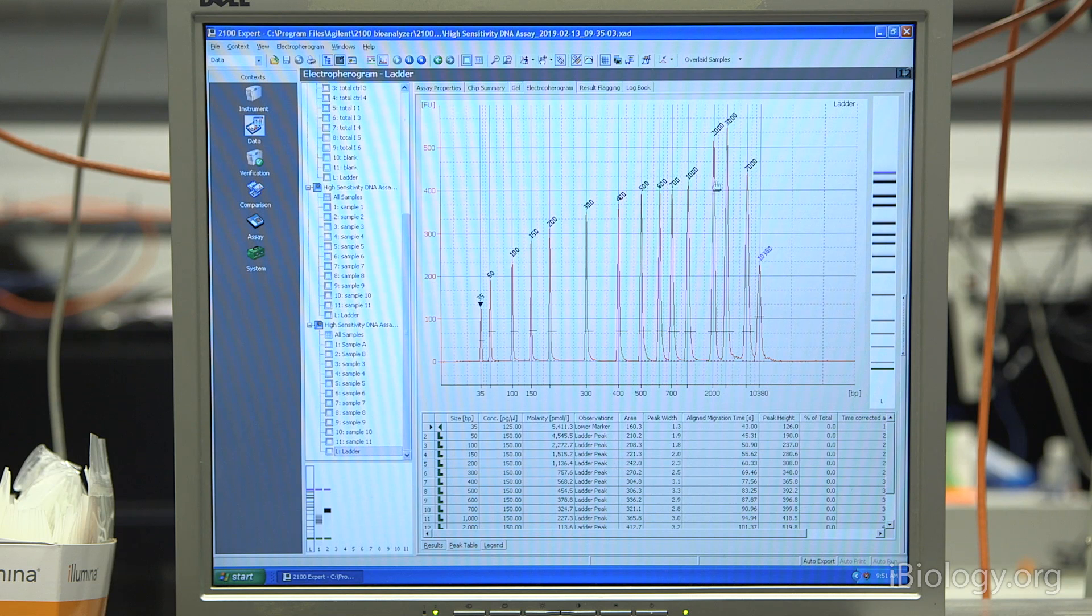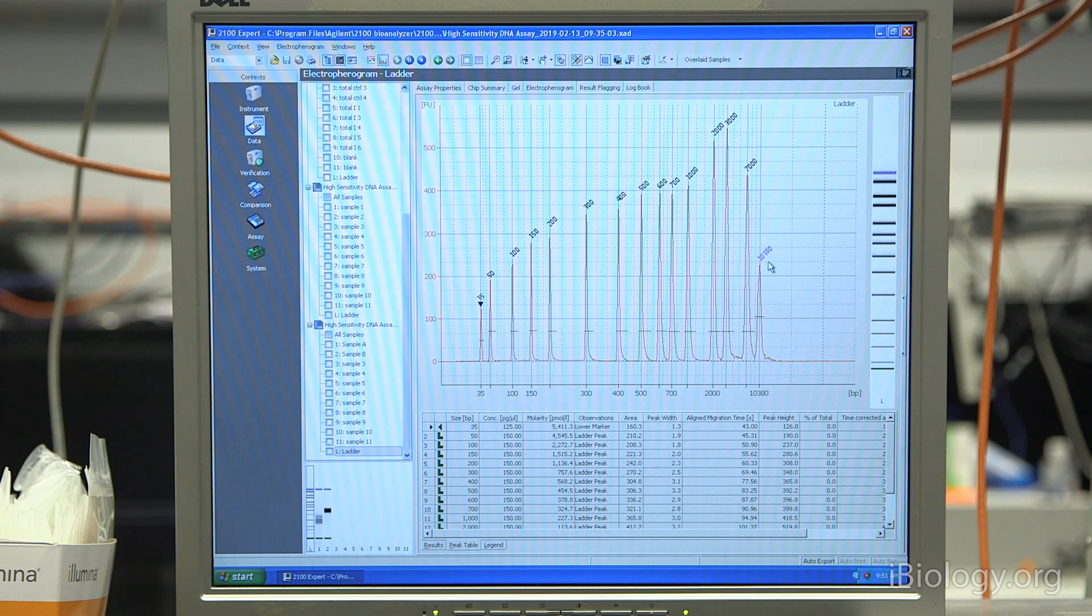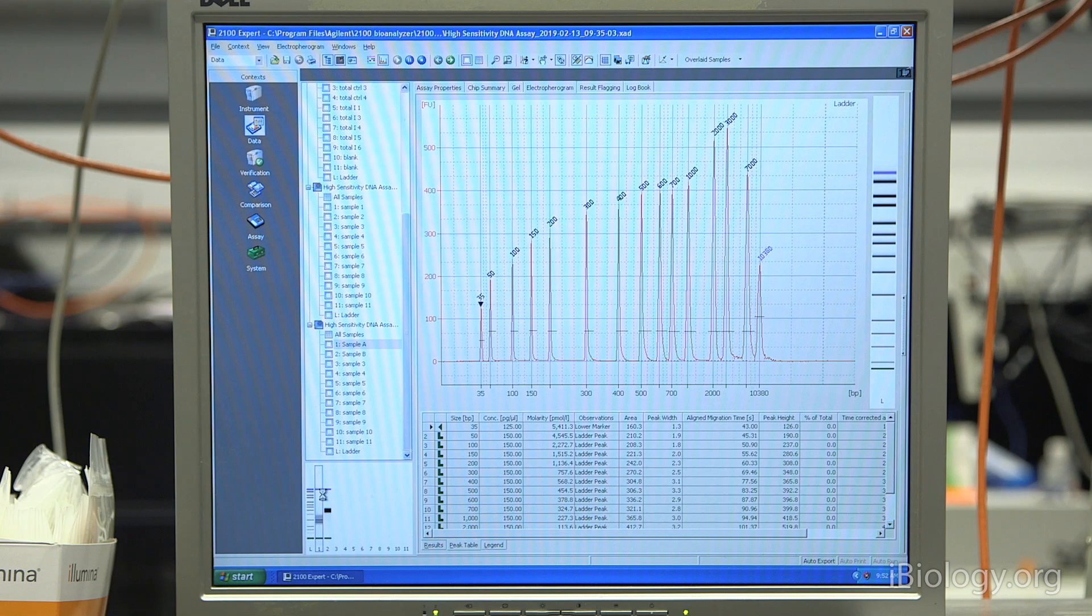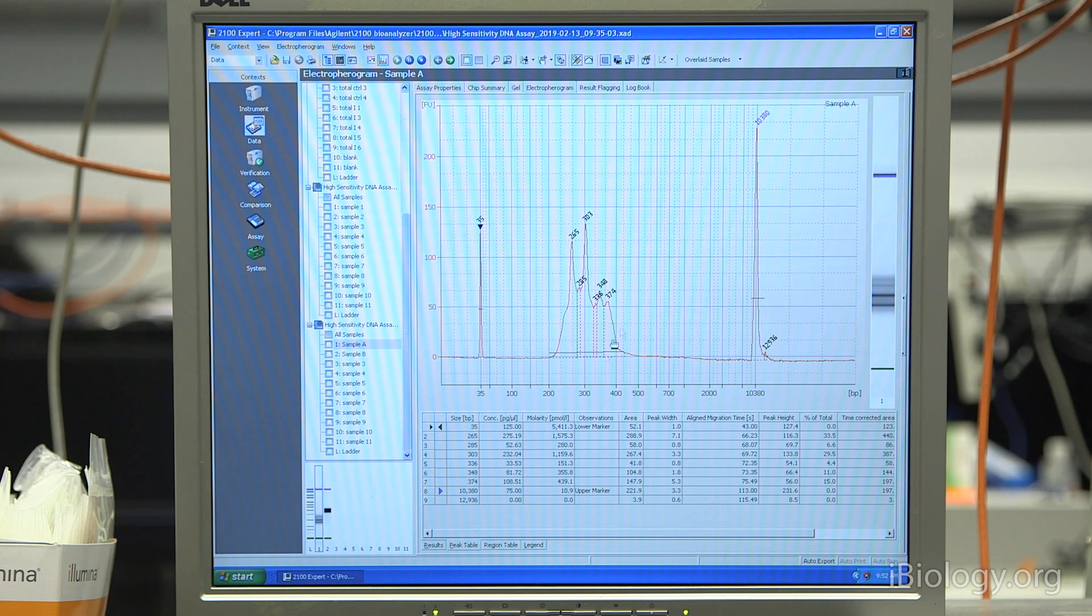If we click on the ladder, it has a series of peaks that are present in that ladder sample. The ladder also contains the marker that we added, the 5 microliter reagent. Those are this 35 base pair and roughly 10 KB base pair fragments that are present in all samples. The ladder is used as a reference because we know the sizes, and we correlate it with the time that it takes for those samples to come through the chip. We have these internal references that we'll use compared to each of the samples. Now if we click on sample A, it'll also have that 35 and 10 KB marker that are used to generate the sizing of these samples.